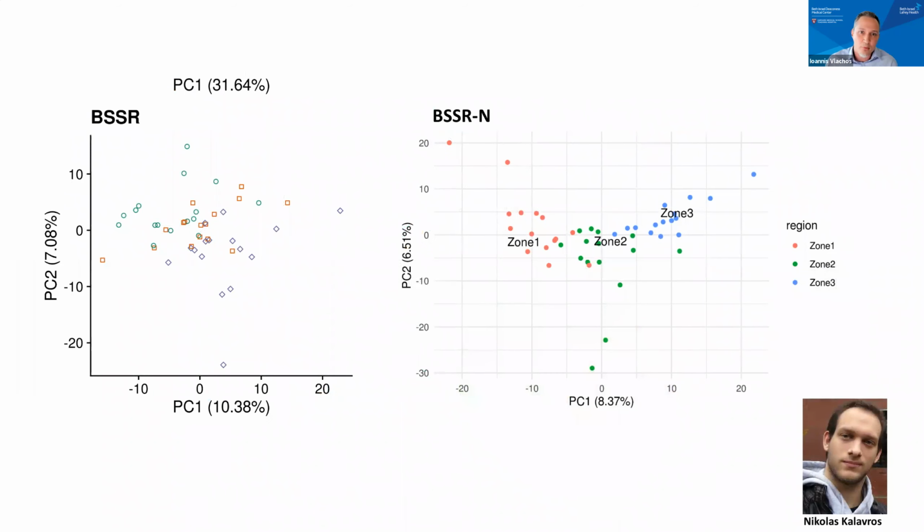So the method was redesigned during the past few months and extended by Nicholas from our group. It enabled us to acquire a very clean signal also for zone 2 regions. As you see, they're collapsed here, and it enabled us to also segregate those, which is the first time for human liver data, because zone 2 is a transition between the 2 states.